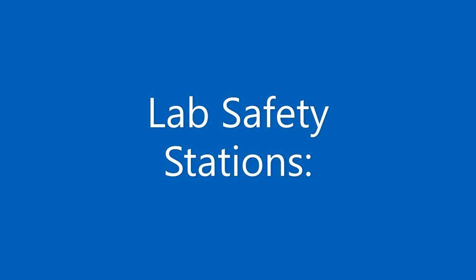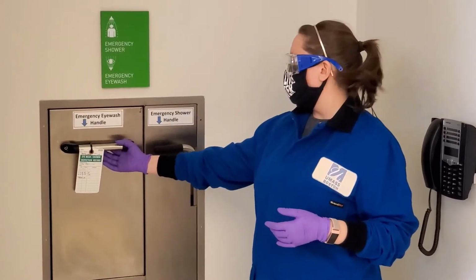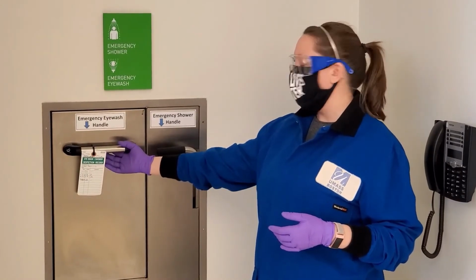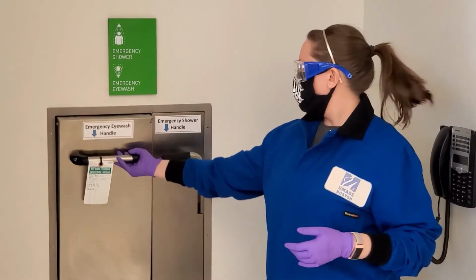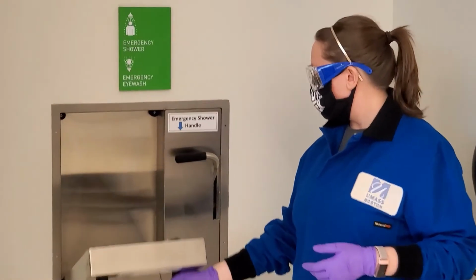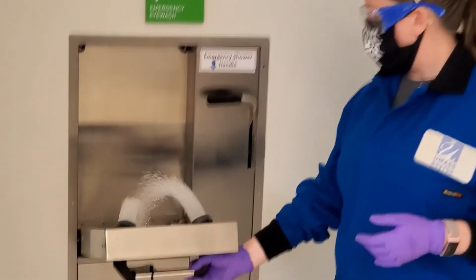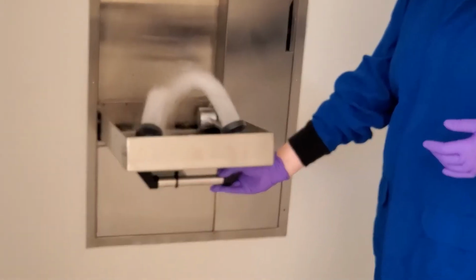Now let's go over the lab safety stations. The emergency eye wash and safety showers can be found in one of the front corners of your lab. If you get a chemical in your eye, go immediately to the eye wash station, pull down the eye wash station door. The water will start running immediately. Keep your eyes in the stream of the water for 15 minutes.